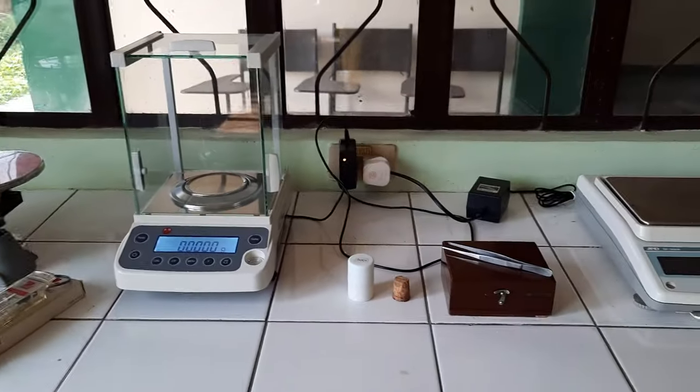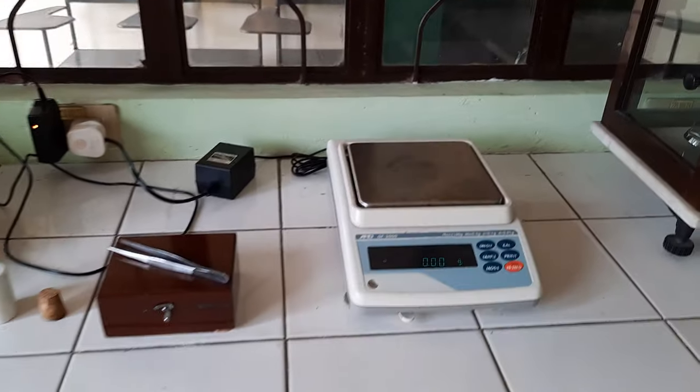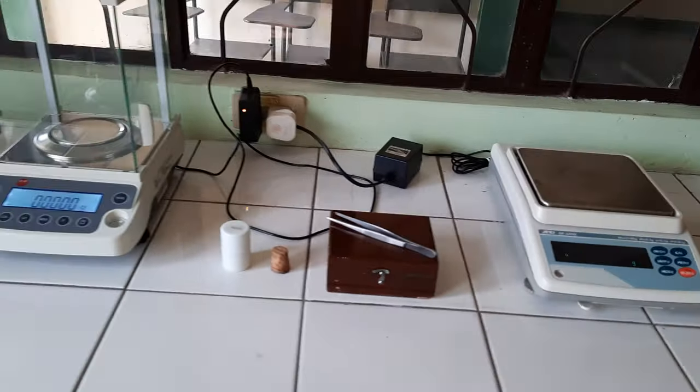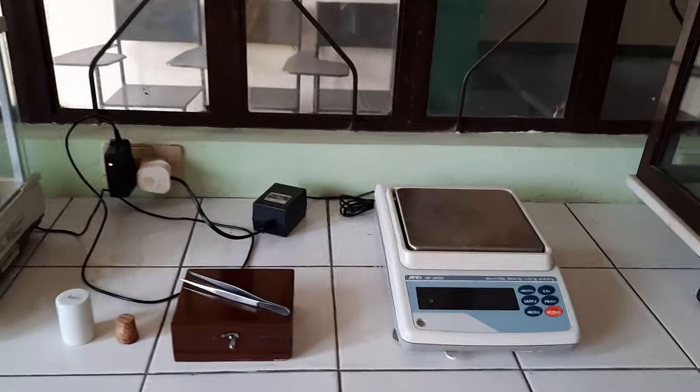Along with those mechanical balances, we also feature our electronic balances. Here we have two of these electronic balances.